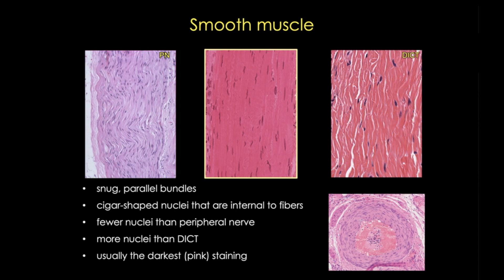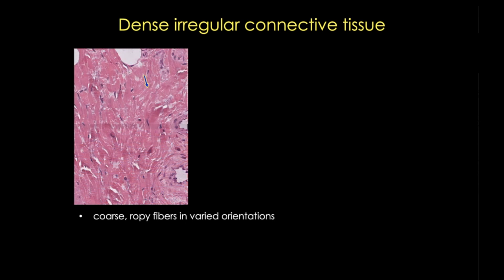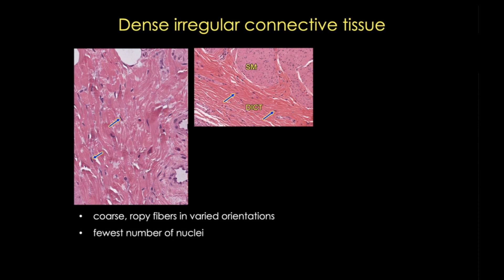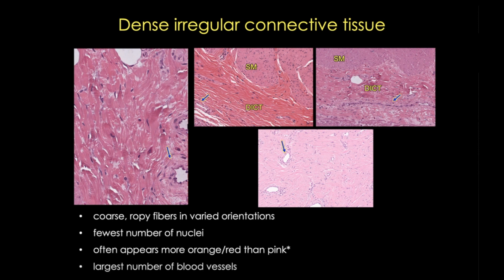Now, what about dense irregular connective tissue? The most obvious characteristic of this tissue is the thick ropey collagen fibers that are variable in both size and direction, and you can really appreciate that in this higher magnification. Dense irregular connective tissue also has the fewest visible nuclei, which lie external to those collagen fibers, and the tissue often appears more red-orange than pink, although this is not always true. In this section of dermis, for example, we see that the tissue is staining a very pale pink, but we see irregular fibers, a lack of abundant nuclei, and abundant blood vessels — and this marks this tissue as dense irregular connective tissue.